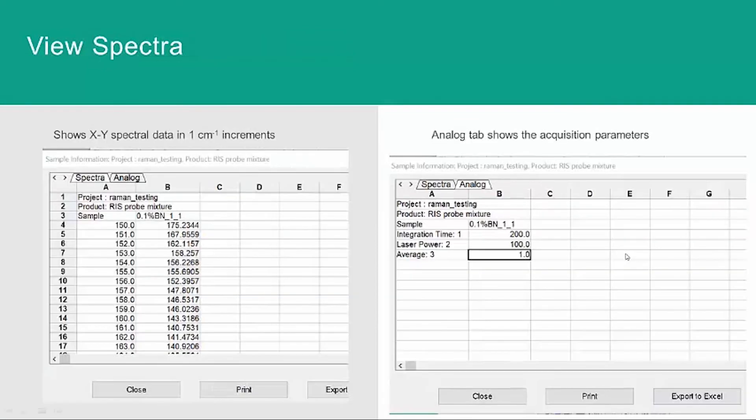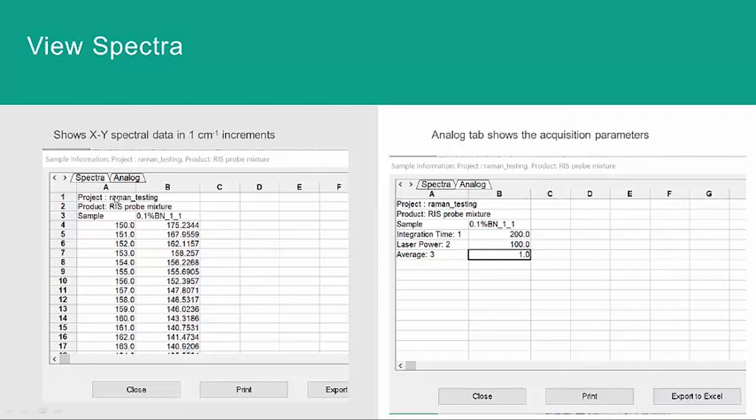We can also view the data as XY data in one wavenumber increments by right-clicking on a sample scan and choosing spectra. And we see the XY data, and then under analog, it shows the acquisition parameters for a sample scan.